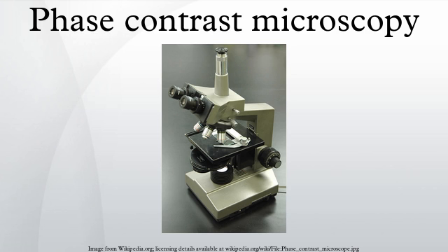When observing an unstained biological specimen, the scattered light is weak and typically phase-shifted by -90° relative to the background light. This leads to the foreground and background having nearly the same intensity, resulting in a low image contrast. In a phase contrast microscope, the image contrast is improved in two steps. The background light is phase-shifted -90° by passing it through a phase shift ring. This eliminates the phase difference between the background and the scattered light, leading to an increased intensity difference between foreground and background. To further increase contrast, the background is dimmed by a gray filter ring.